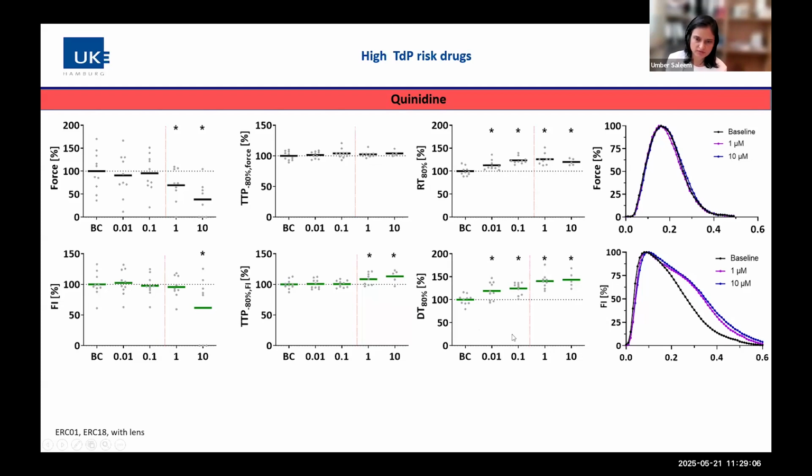So we can monitor that it shows prolongation in decay time. That's for this category, we can show similar results as were shown in this categorization.